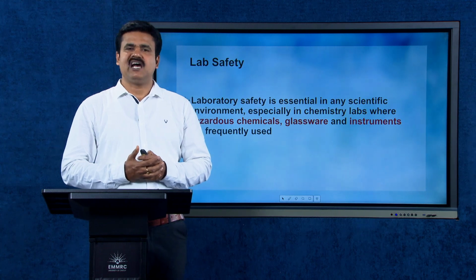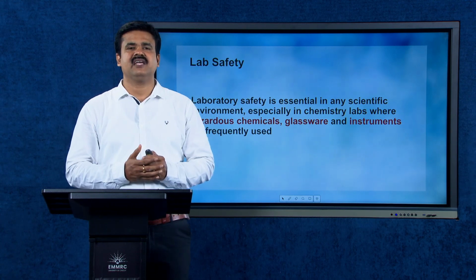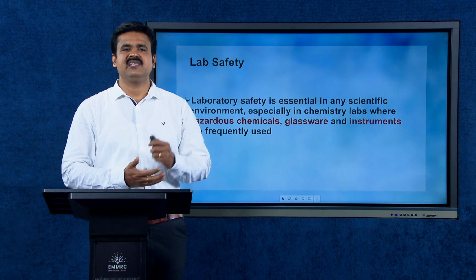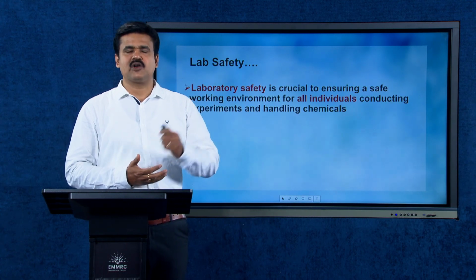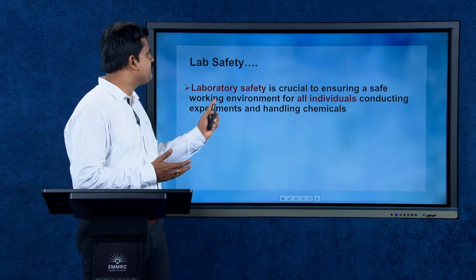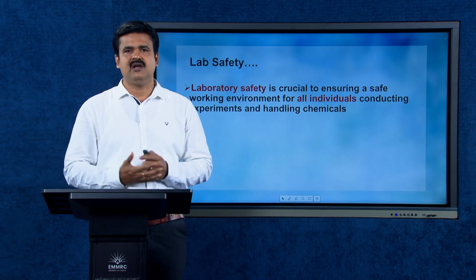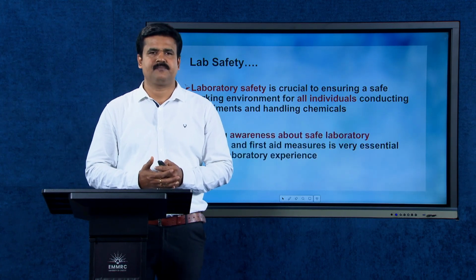Laboratory safety, or lab safety, is essential in any scientific environment, especially in chemistry labs where hazardous chemicals, glasswares and instruments are frequently used. Laboratory safety is crucial to ensuring a safe working environment for all individuals, teachers, students, lab staff, all conducting experiments and handling chemicals.